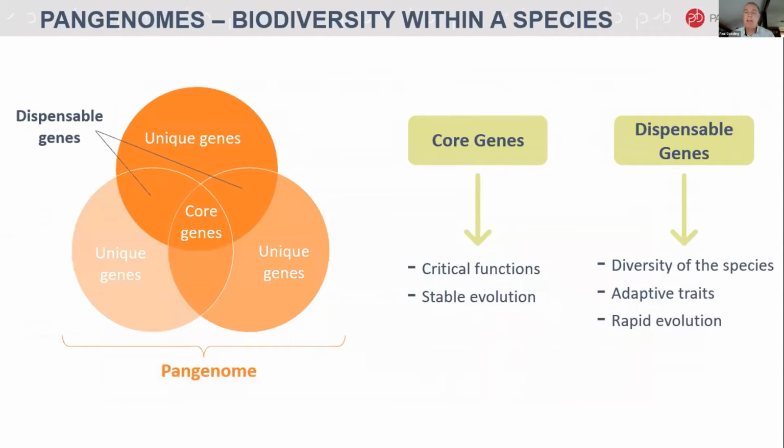Something else that people are very interested in using PacBio HiFi data for now is pangenomes. There's a big trend towards this, particularly in plant genomics, for agricultural research and for breeding programs. It's long been realized that to get a complete picture of the genomics of a species, it's not just an individual. You need to find out all the differences with all the different varieties and the different lines, and this is helpful for plant breeding and manipulation, of course.